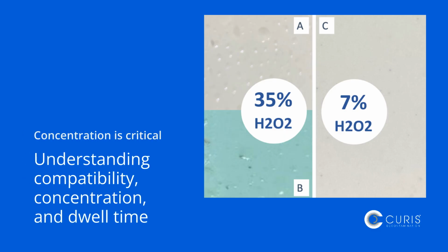Concentration is also critical. Too diluted and the disinfectant won't work. Too strong and it may pose safety risks or damage sensitive equipment. Understanding compatibility, concentration, and dwell time is what separates routine cleaning from true contamination control.